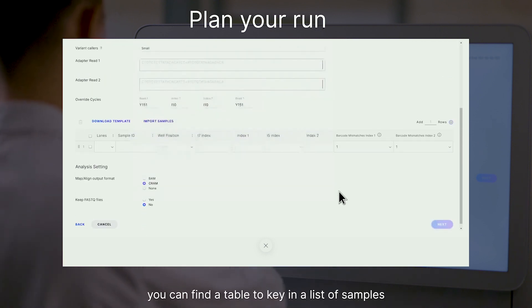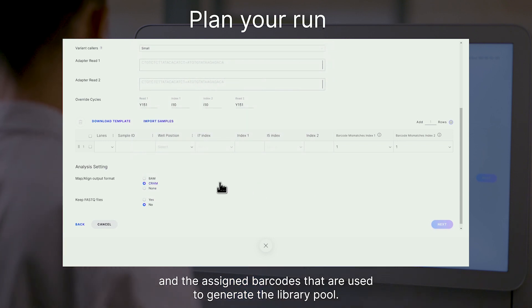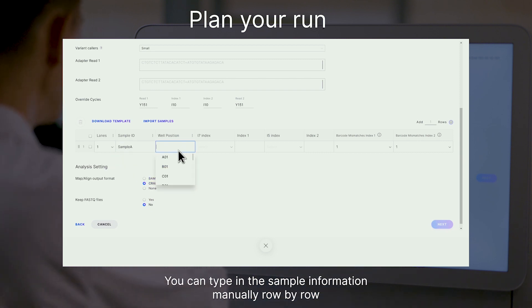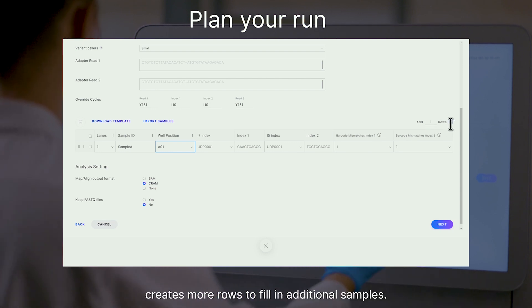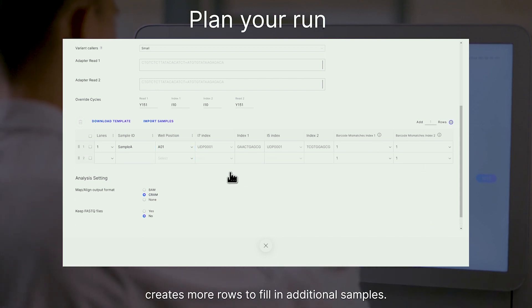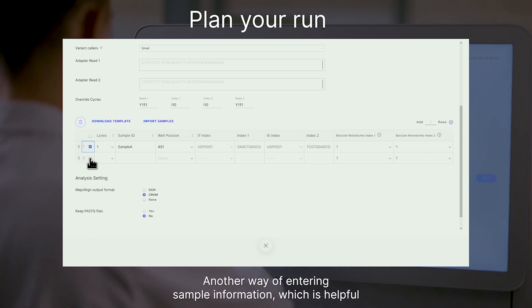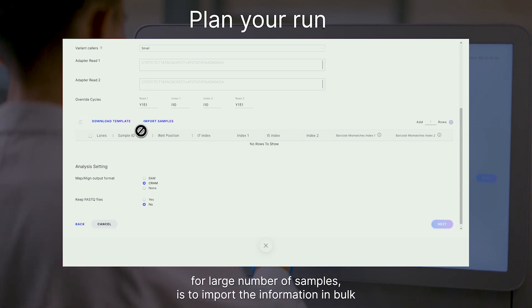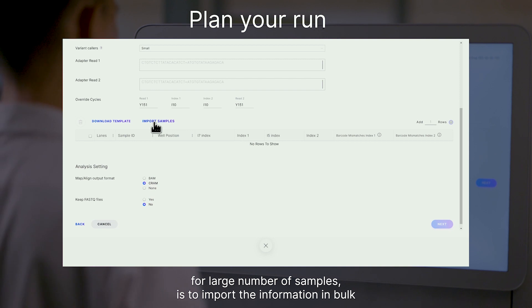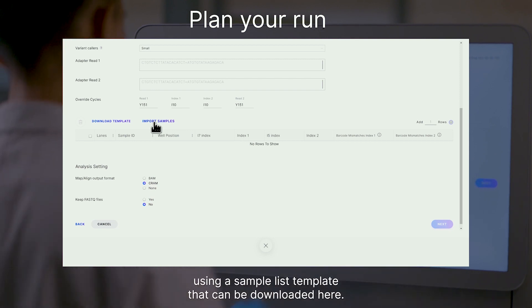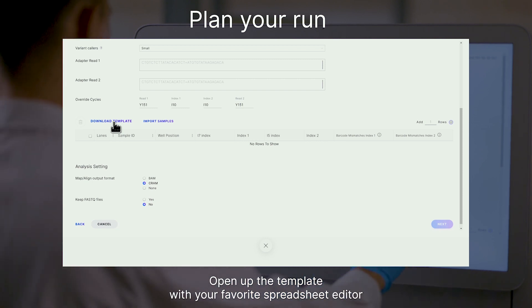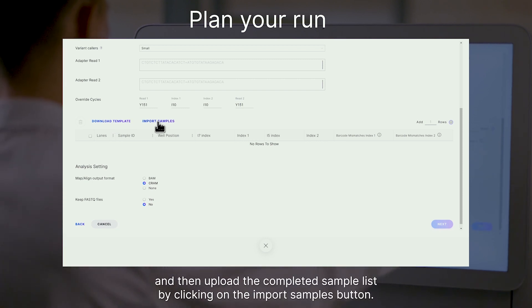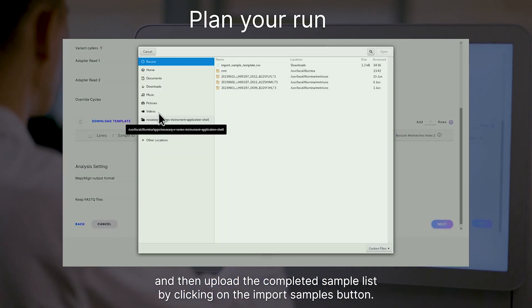Scrolling down, you can find a table to key in a list of samples and their assigned barcodes that are used to generate the library pool. You can type in the sample information manually, row by row. Clicking the plus button creates more rows to fill in additional samples. Another way of entering sample information, which is helpful for a large number of samples, is to import the information in bulk using a sample list template that can be downloaded here.